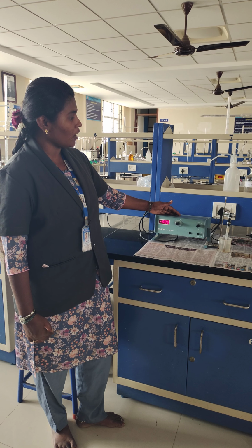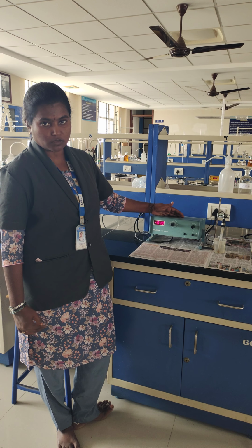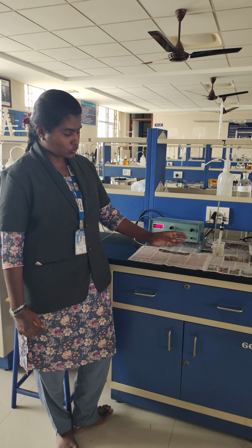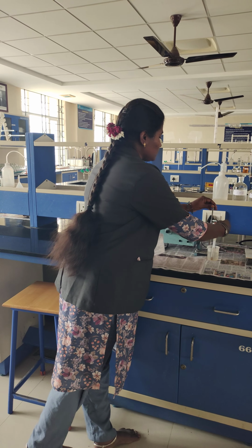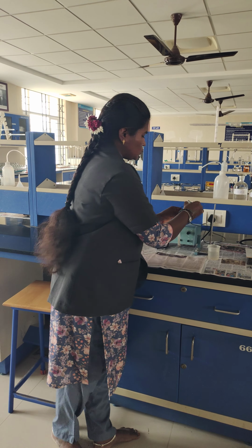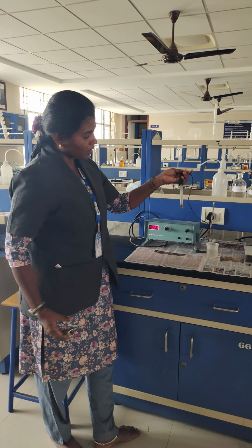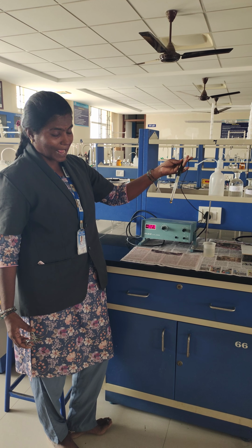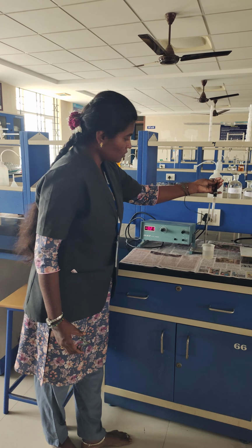For that we have to take the sodium hydroxide in a burette, and the hydrochloric acid has to be taken in a beaker. Additionally we have to add 20 ml distilled water. This is the ion selective electrode. For this meter, a glass electrode is used as the ion selective electrode.